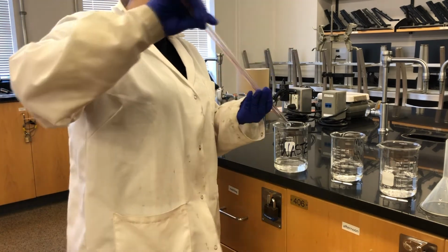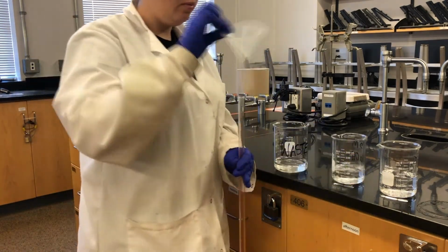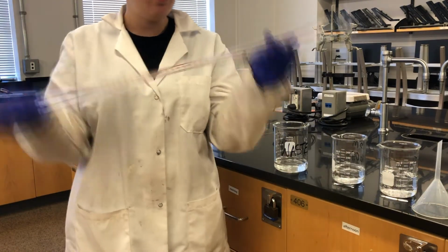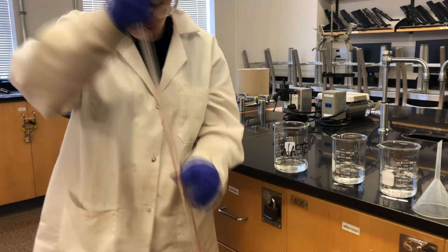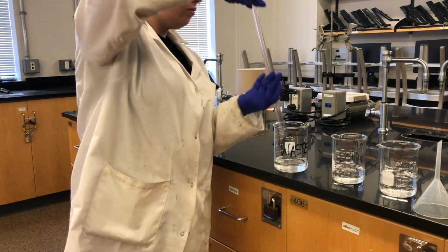After conditioning twice with water and then twice with our 0.5 molar sodium hydroxide, we fill up the burette to somewhere near the top, anywhere between the 0 and the 5 milliliter mark. After removing the funnel and placing the burette on the burette stand, we record the initial volume of the burette to the nearest 0.05 milliliter mark. Note that the graduations on the burette are read in the opposite direction of those on a graduated cylinder. The reading for this initial volume is 0.25 milliliters.